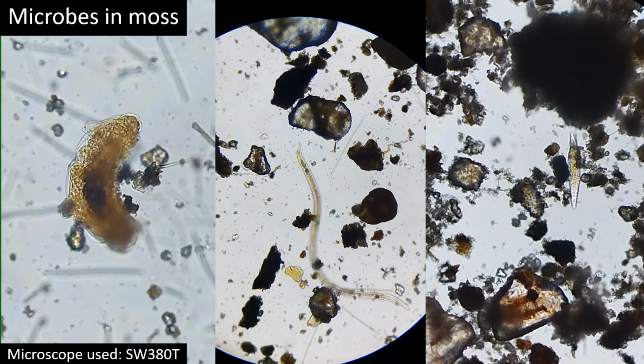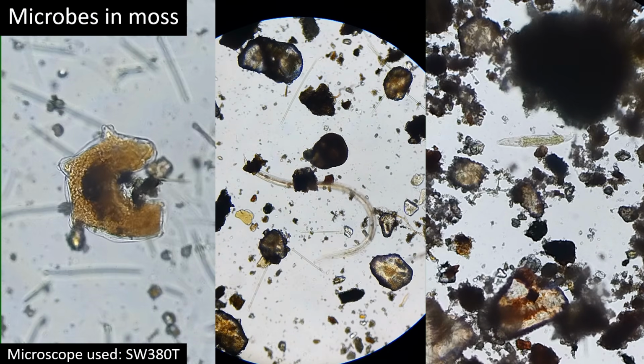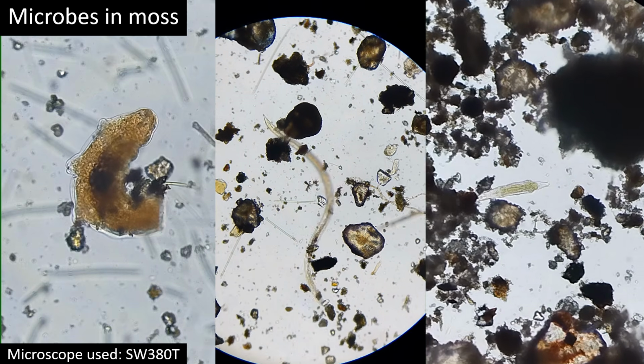In this video, we're going to be taking a look at the different microorganisms that live in and on moss.